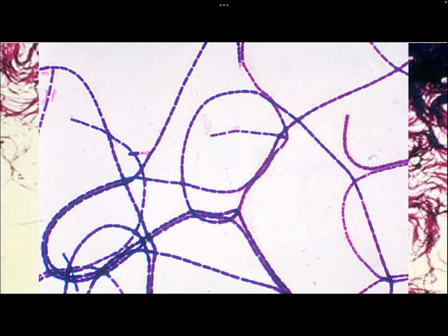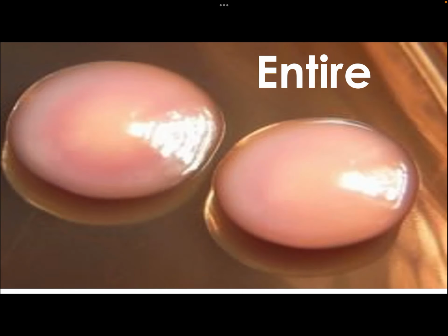Also this one, they are interlacing. The bacilli are interlacing. Another one, this is a type of colony growing in MacConkey. So the margin, the edge is soft, smooth. The edge is smooth, so that is what we call entire. Smooth or entire, or another term is even.